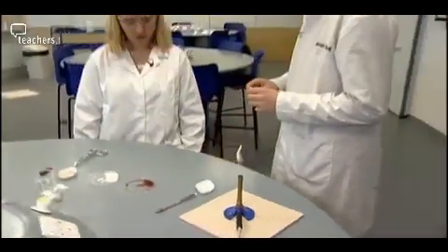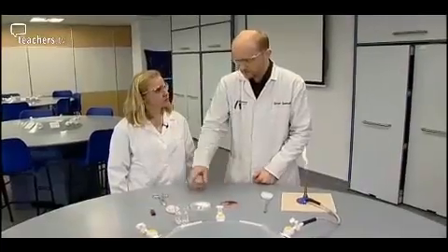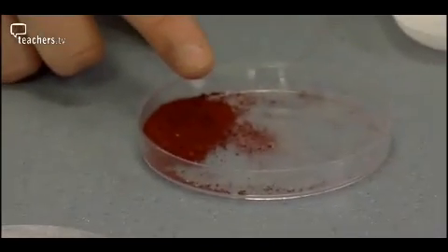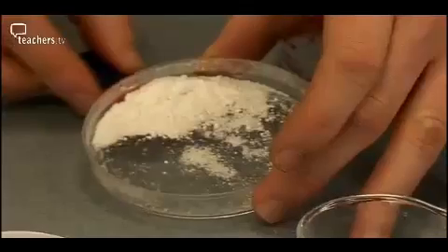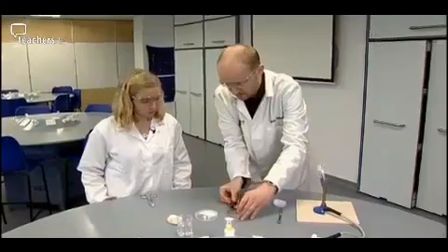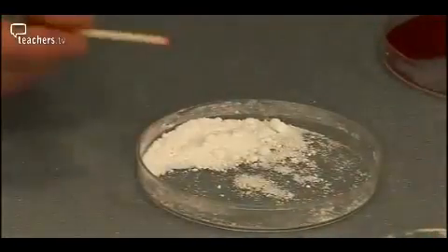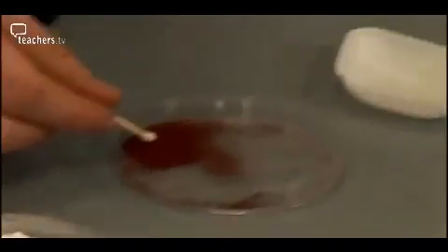Here we've got a really simple experiment where we're going to reduce this iron oxide. We've got some non-safety matches, some sodium carbonate, and some iron oxide. First we can see if they are magnetic — the matches aren't magnetic, the sodium carbonate isn't magnetic, and the iron oxide isn't magnetic. As we take a match and dip it into some water, the sodium carbonate helps bind the iron to the match head. Then we do that again and roll it into the iron oxide.